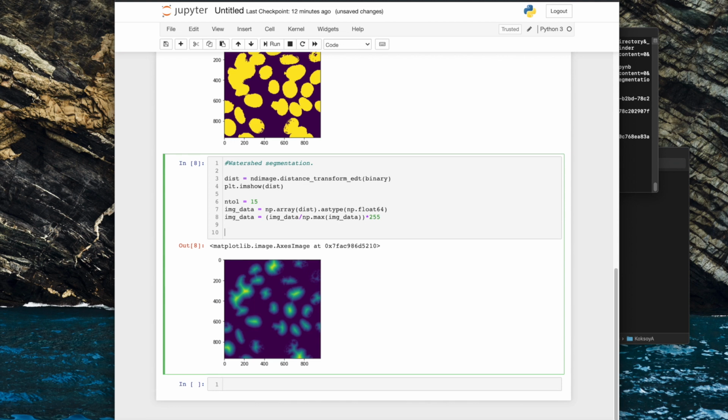And then what we do is calculate first the local max. This is the function I had before at the top, and this is the input for the Find-maxima algorithm, which basically prunes away the smaller peaks and joins them up. The local max will find many peaks, and I'll show you that.